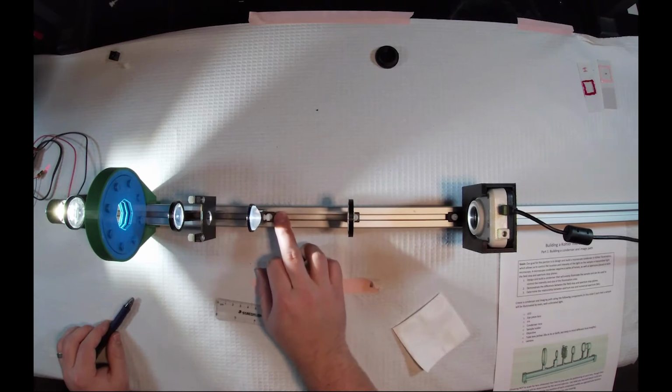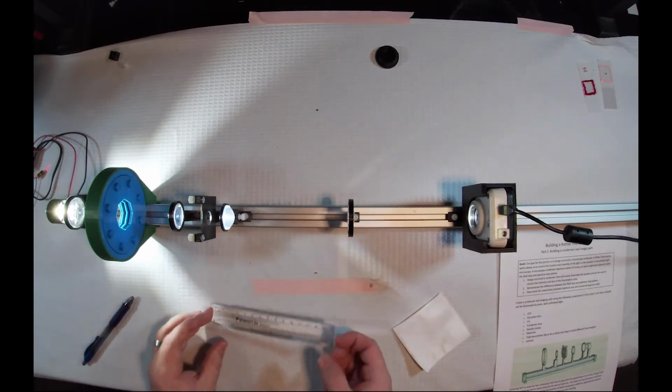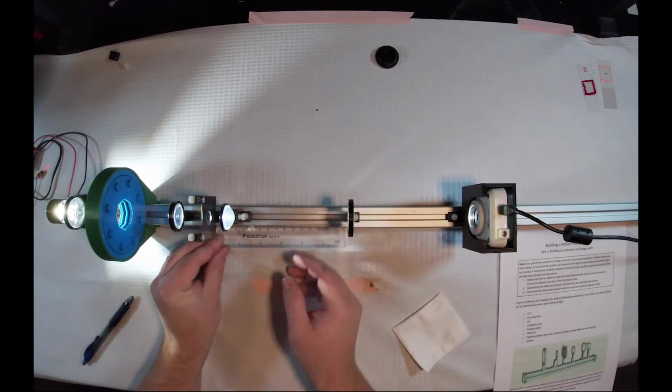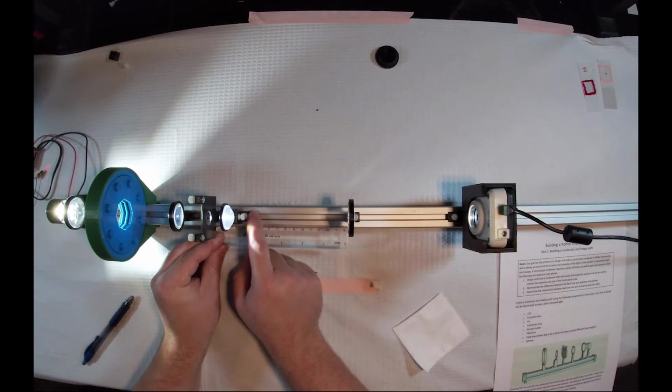Next, we're going to need to put our objective lens one focal length away from our sample, because it will be taking any divergent light and collimating it away. So I'm going to mount this 20 millimeters away.